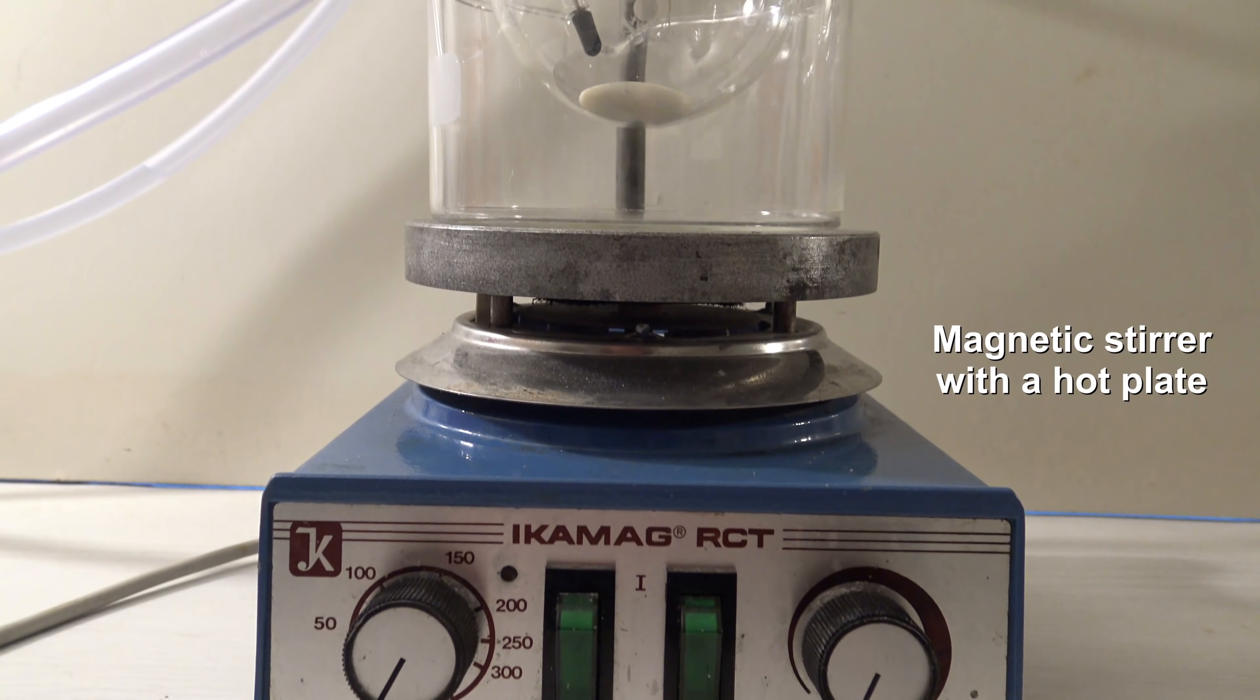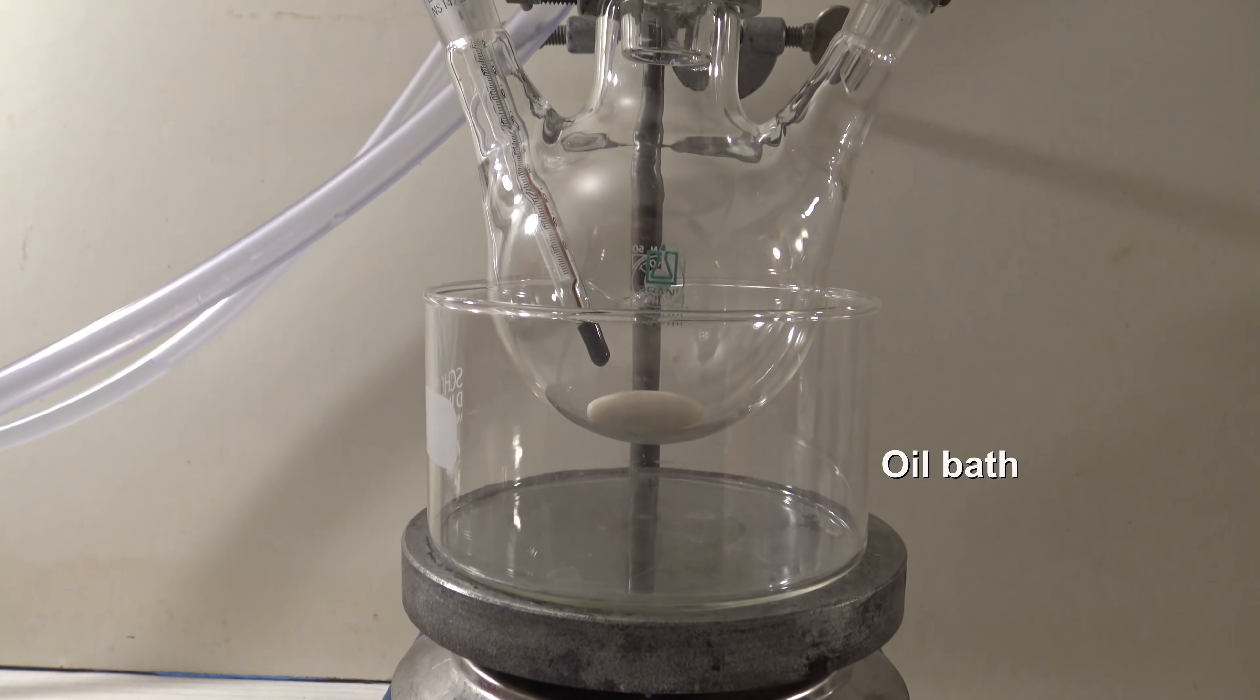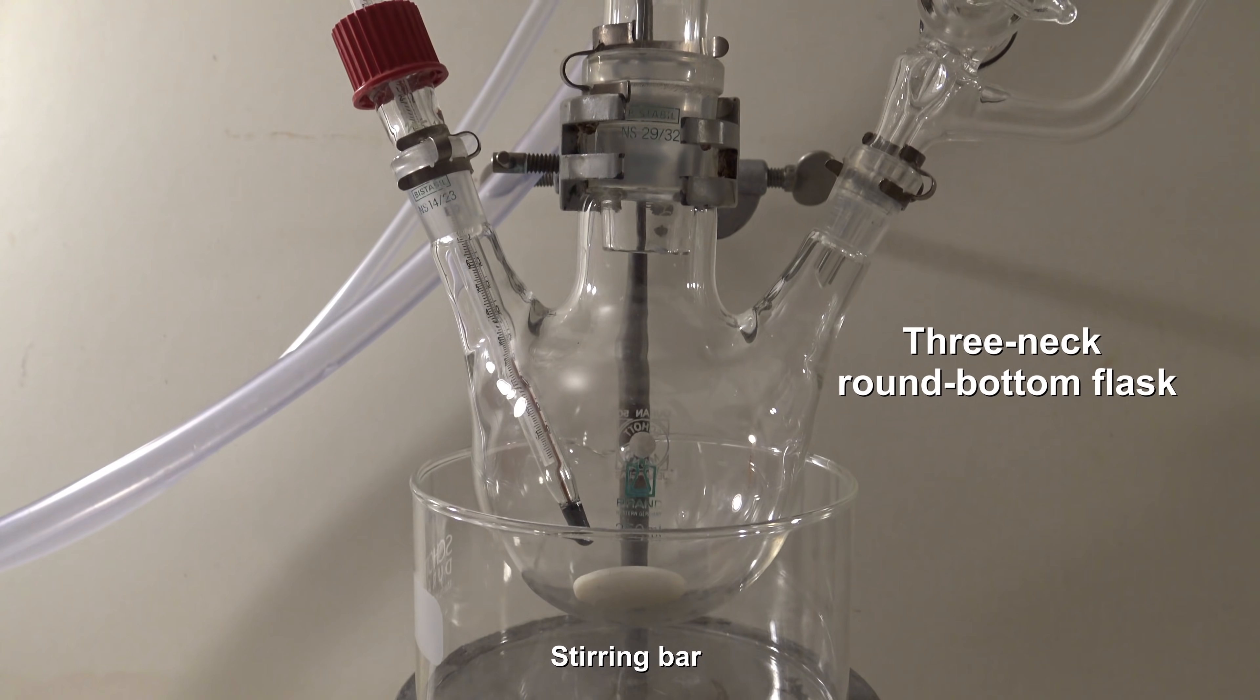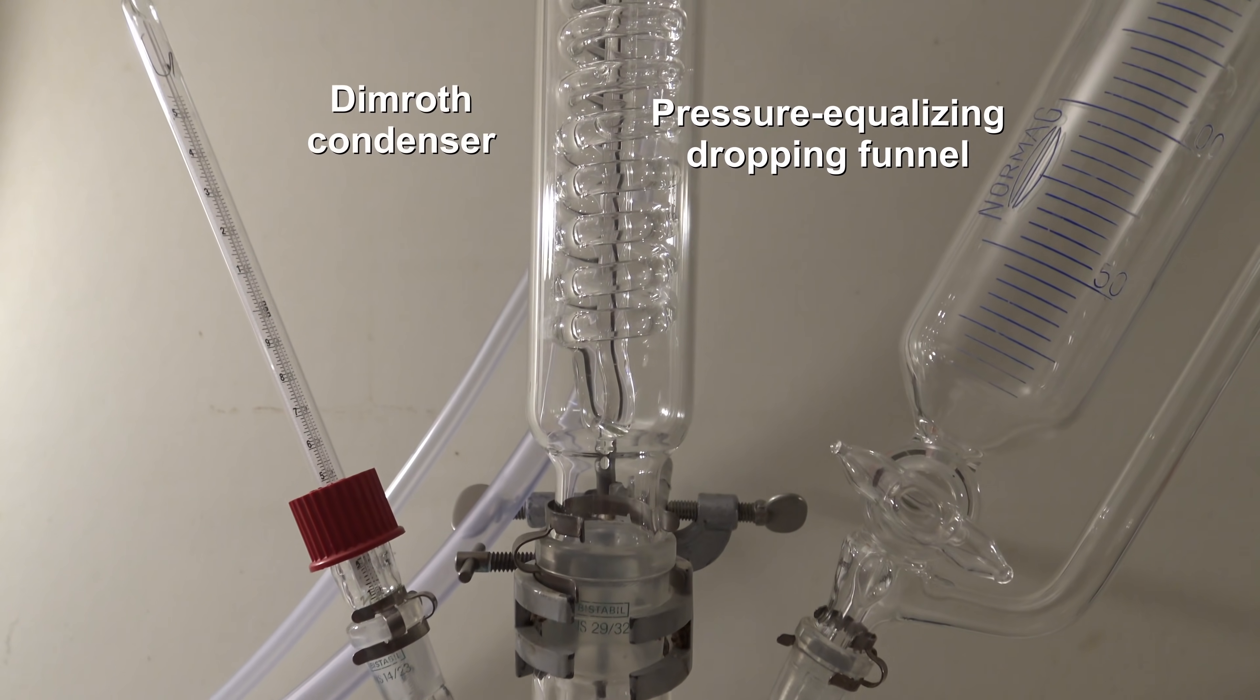The setup is a magnetic stirrer with a hot plate and an oil bath. In the oil bath a three-neck ground-bottom flask is placed with a stirring bar. On top is a thermometer, a pressure-equalizing dripping funnel, and a dimroth condenser.